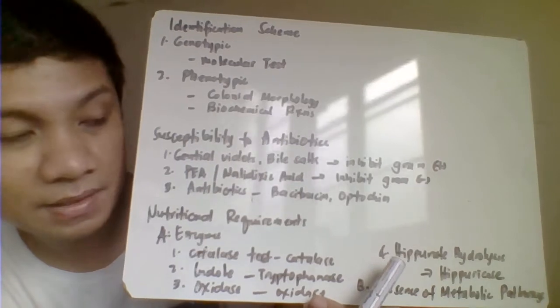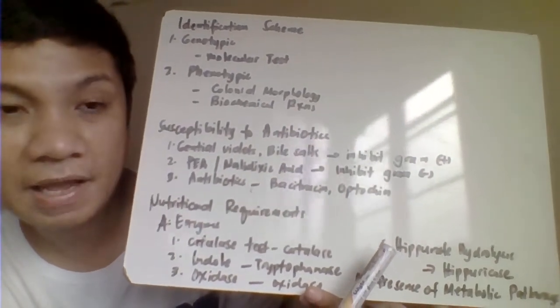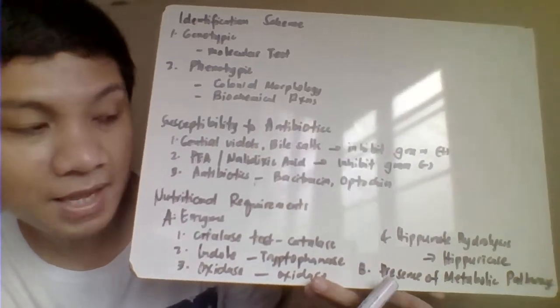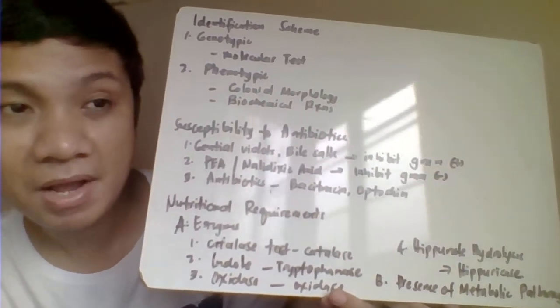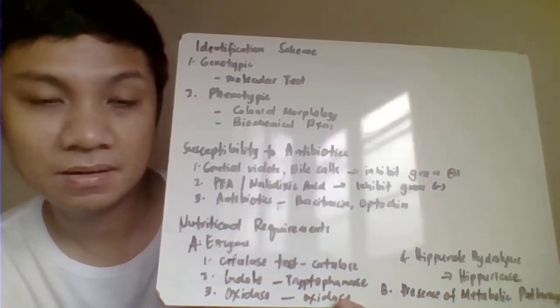The hydrolysis test is for identification of hippuricase. And then we have also other biochemical reactions that try to detect your metabolic pathways. Okay, thank you.